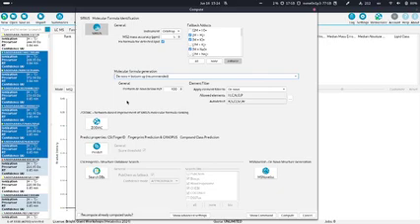The bottom-up search does something like the database search, but it searches in a convoluted database consisting not only of molecular formulas from a structured database, but also applies biotransformations and neutral losses to them. And the problem with the de novo search is that it gets really slow at high masses. If you do de novo for 1,000 Dalton or 2,000 Dalton, then you often get millions of molecular formula candidates, and it will take hours or even days to compute them.